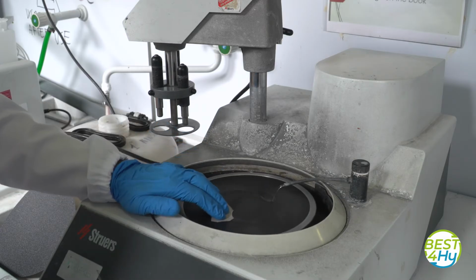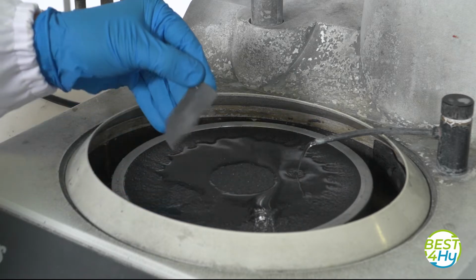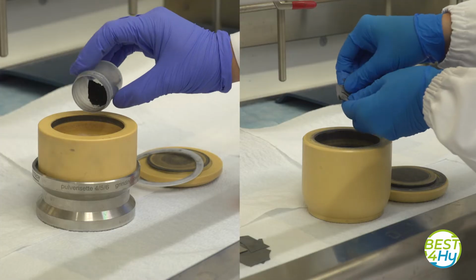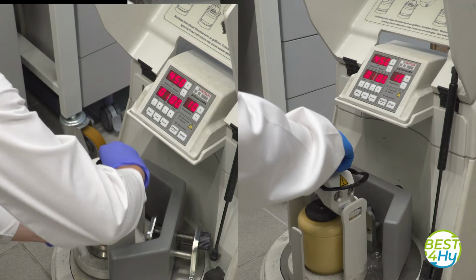Meanwhile, cathode residuals are polished away from the half cell to guarantee the purity of the materials recovered from the anode components. Both dried cathode powders and fragments of the polished anode cell are placed in a grinding bowl and milled in a planetary mill for a few hours.